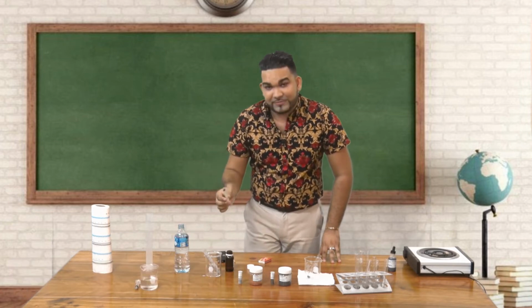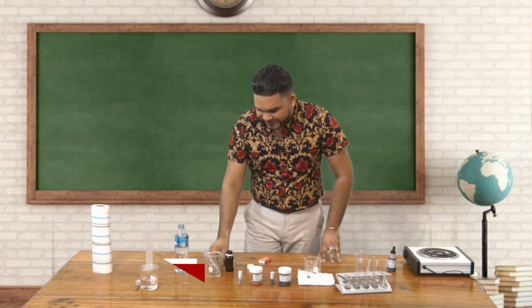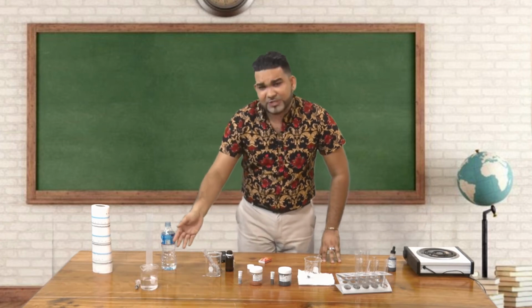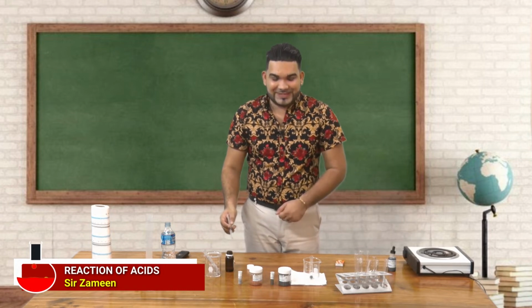I have 2 different syringes that I'll be using. One will be used only for the sulfuric acid and the other one will be used only for hydrochloric acid. Okay, boys and girls, let's get straight into the activity.